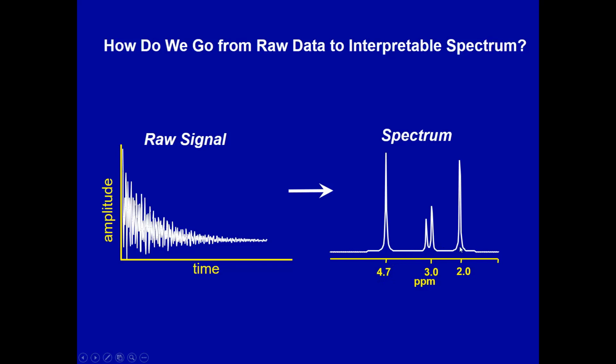These things have other frequencies. They can be a few hundred hertz away from here, so they will precess and oscillate relative to our reference. So this average behavior is coming from the residual water that we did not succeed in entirely suppressing, and these other oscillations come from this. Now, very few people would be able to look at this signal and tell you what frequencies comprise it. This spectrum on the right came by doing a Fourier transformation of this.